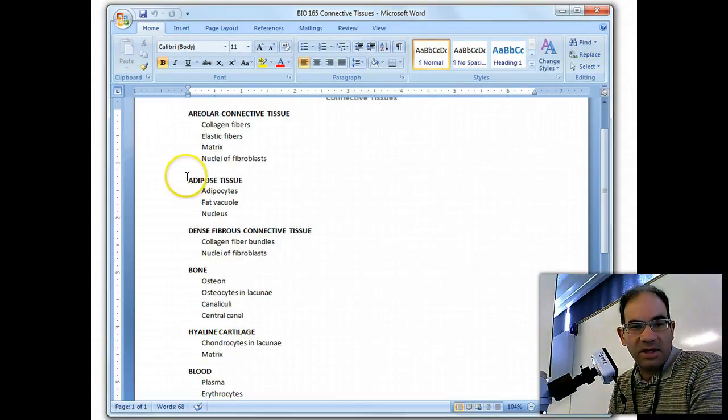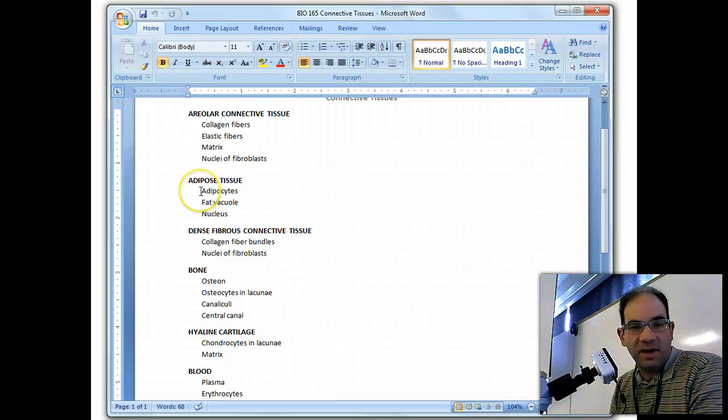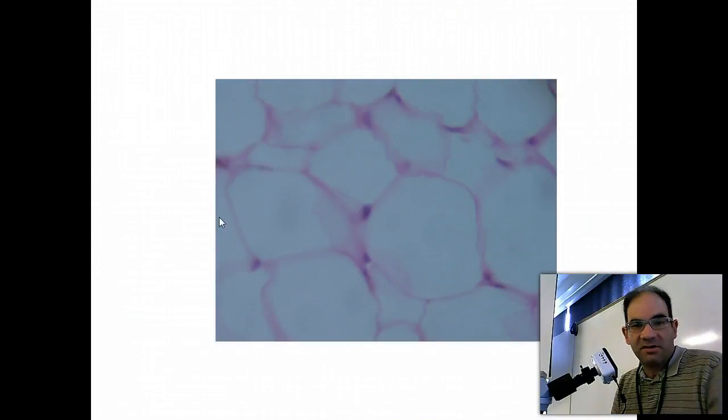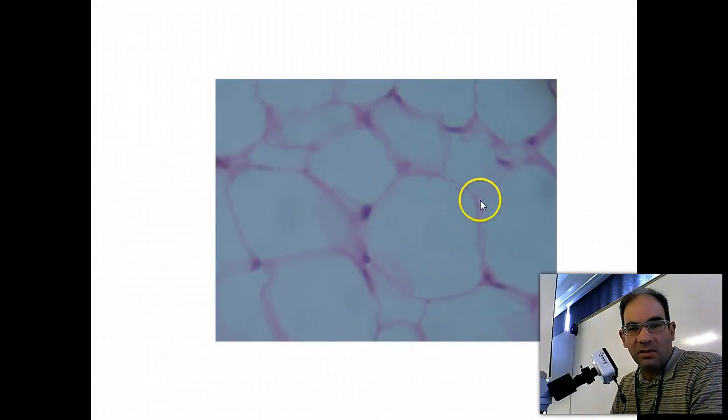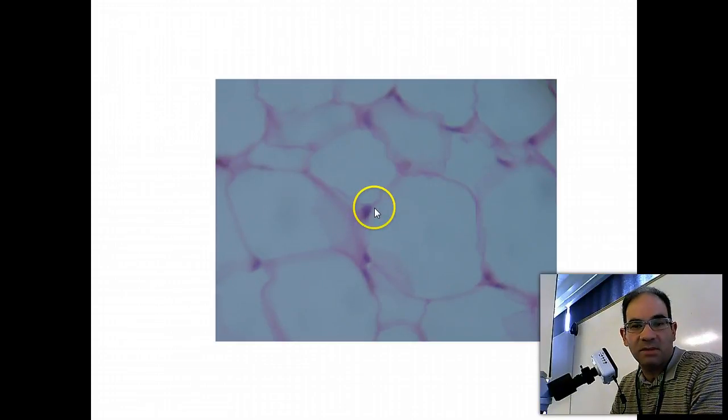Next, we'll look at adipose tissue, which is our next tissue type. And you're responsible for adipocyte, fat vacuole, and nucleus. So I've got some adipose tissue here at 400x, and this outline right here is the individual cell. This is the adipocyte. And everything in the middle of the cell is the fat vacuole. And then the dark staining structure, which is always pushed up against the edge of the cell or the cell membrane, that's your nuclei of the adipocyte. So there's your adipose tissue.